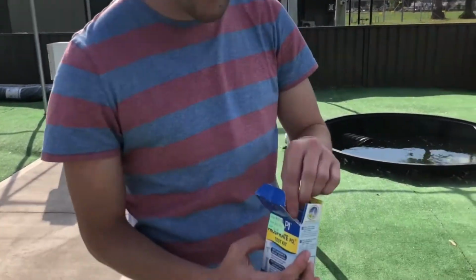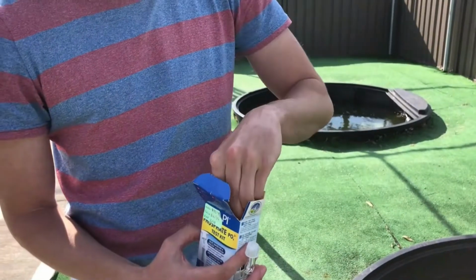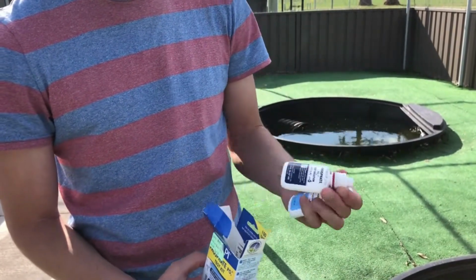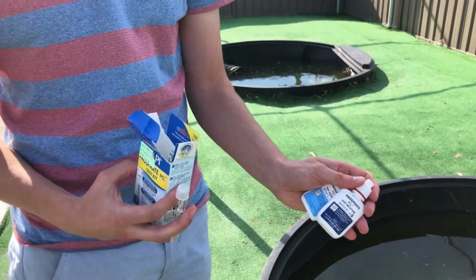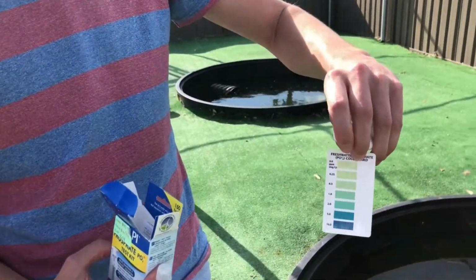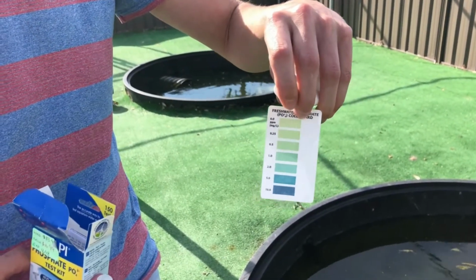In the kit we have a vial which is used to collect the water sample. We have 2 reagent bottles which are used to mix in with the sample to determine the amount of phosphate, and we also have a phosphate chart which you can compare your sample with to measure the amount of phosphate.